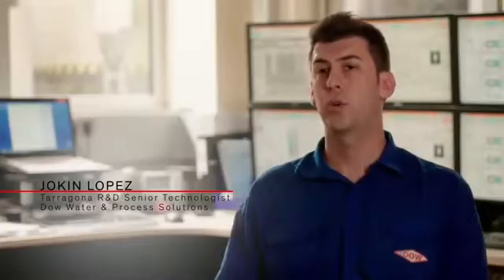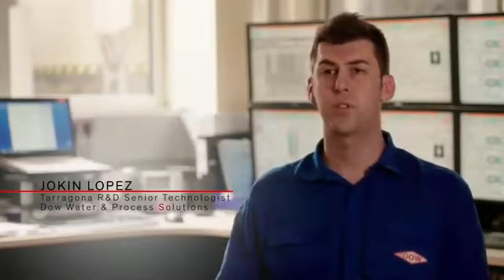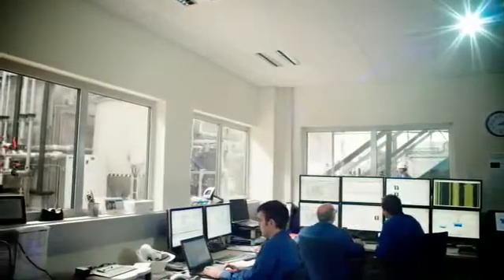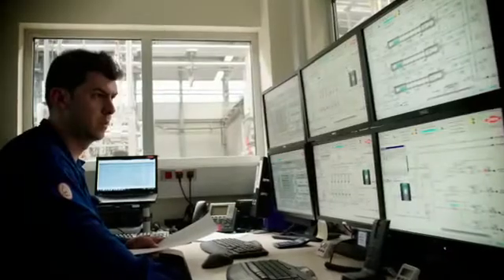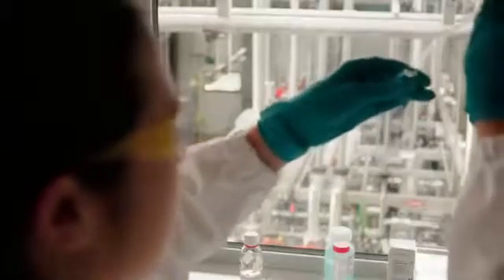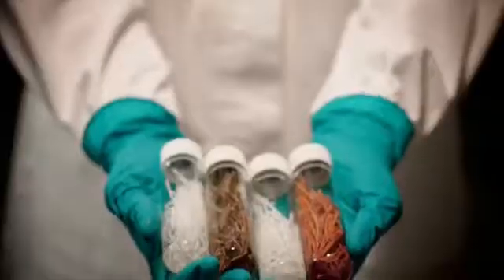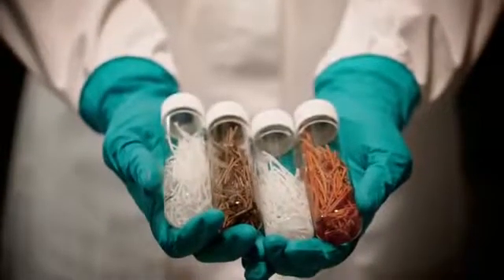Here at the control room we have two operator stations where we can control two lines of ultrafiltration, and also three lines of reverse osmosis. Our team provides data to help customers solve global water challenges. We have more than 80 tests and we receive more than 2,000 samples every month.